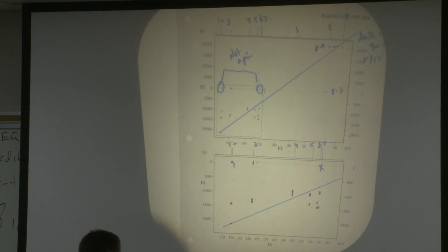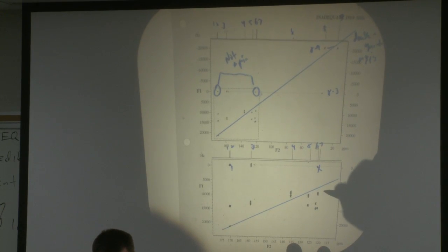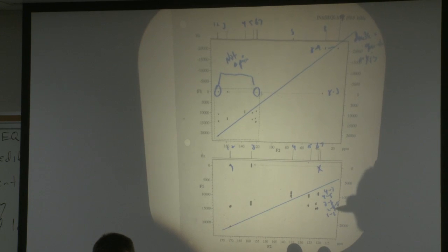you'll see that you can just pick up your pairs. So you're going to get your 4 to 7 pair. You'll get your 4 to 5 pair here. You've got a 3 to 6 pair here. You have a 3 to 5 pair below that, a 2 to 7 and a 1 to 6 pair here.